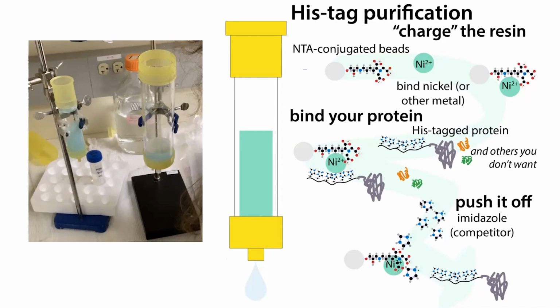The reason why you can do this is because the beads are actually attached to NTA or something like this. Basically, they're attached to something that can bite onto the nickel to bind the nickel, and then that nickel is going to bind to your protein. So the nickel is serving as this intermediary between the beads and your protein, but it's not directly, permanently stuck to the beads.